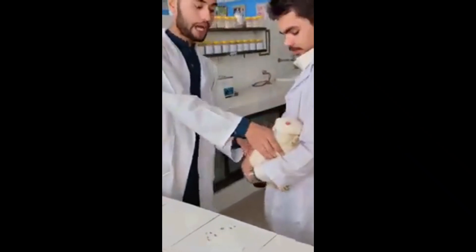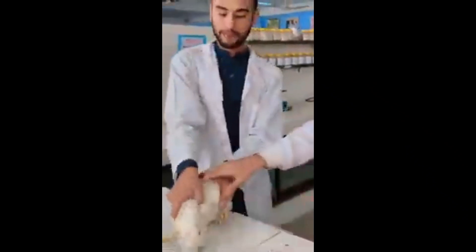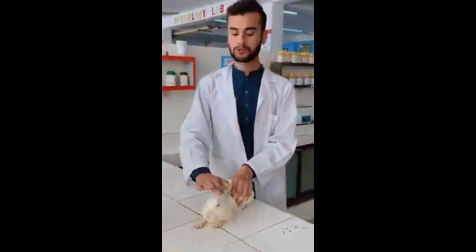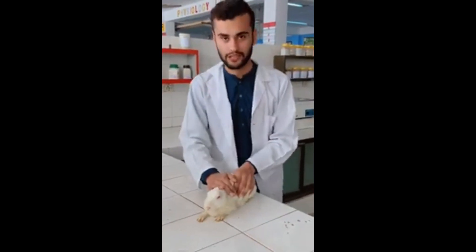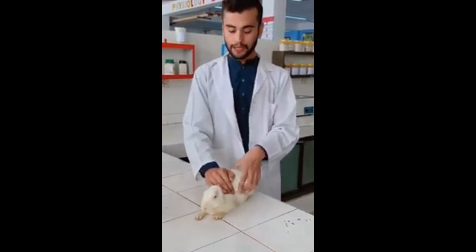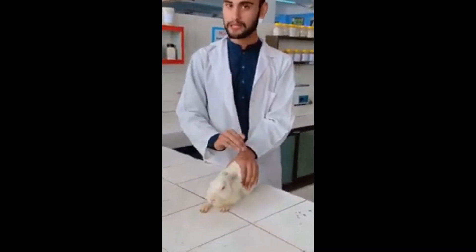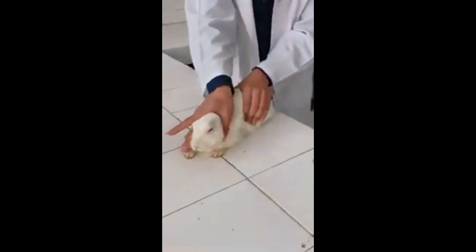First of all, we have a rabbit. We will do a simple handholding on the back and a neck hold on the back.